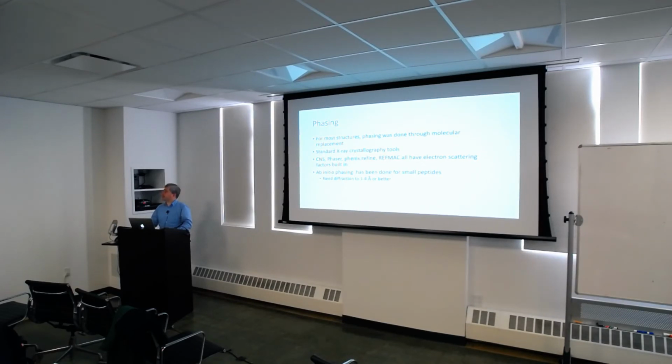The thing is also, in order to collect an image to get phases, you have to give it a higher dose than you do for the diffraction. So you'd have to have a crystal just for that, and then you'd have to figure out how to merge that. I think that is probably going to be a way of the future to do it, but the way they're doing it now, they haven't done that yet.